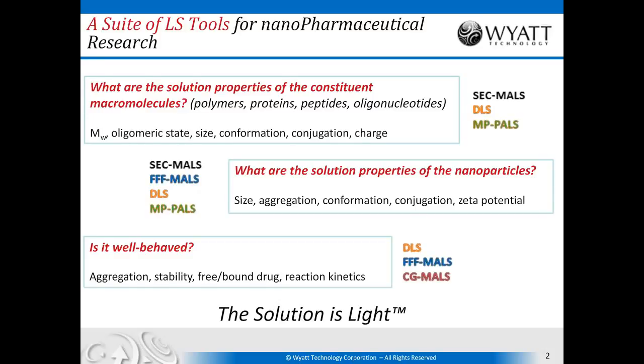And then finally, once you have a product, is it well behaved? So again, how does it behave over time? Does it aggregate? Is it stable? Does the drug which is encapsulated in the particle remain bound, or does it diffuse out into solution? And perhaps the reaction kinetics once it's combined with some reagent which simulates the physiological effects.